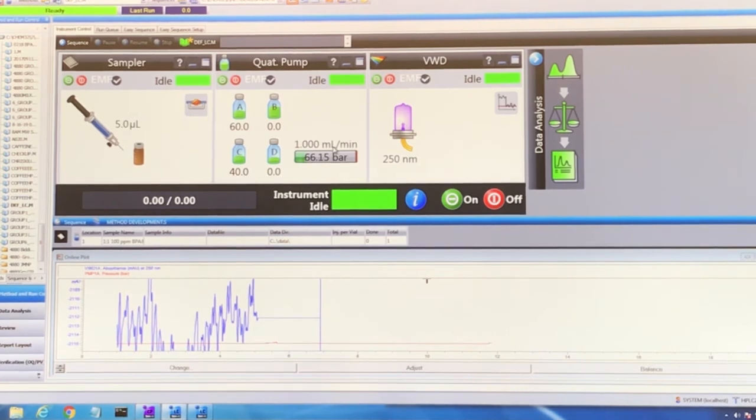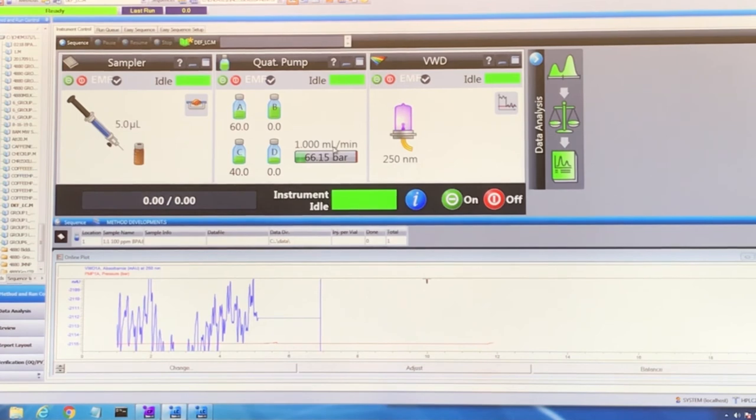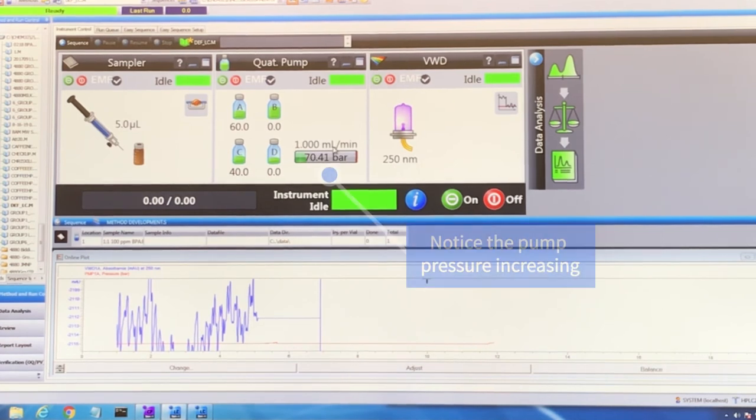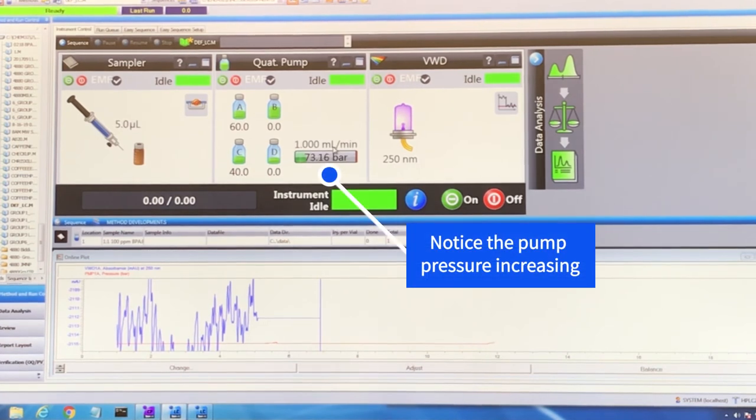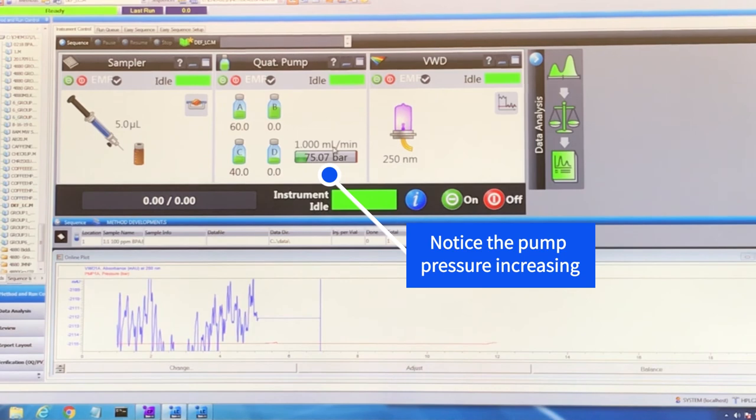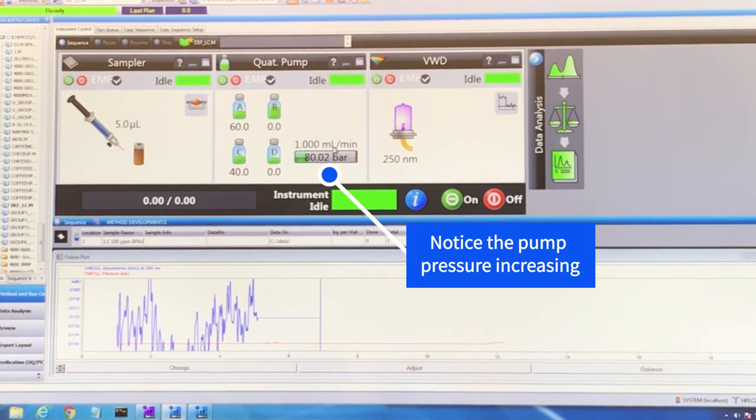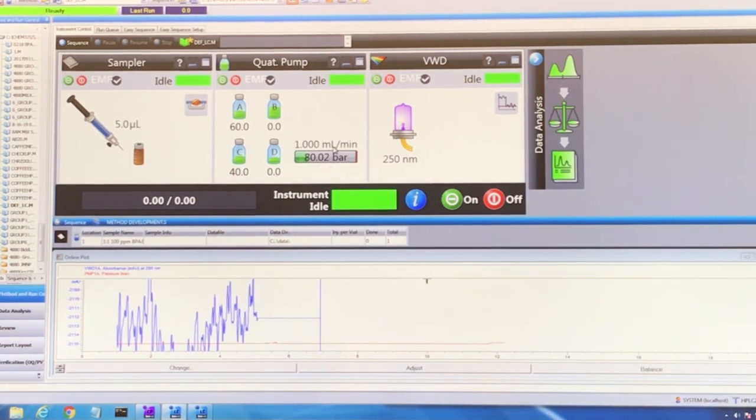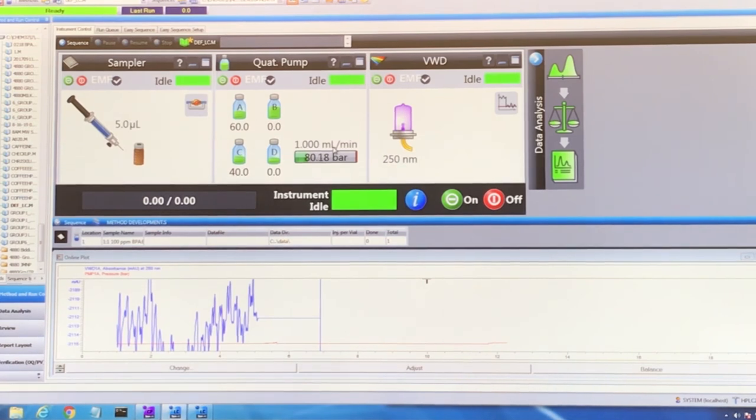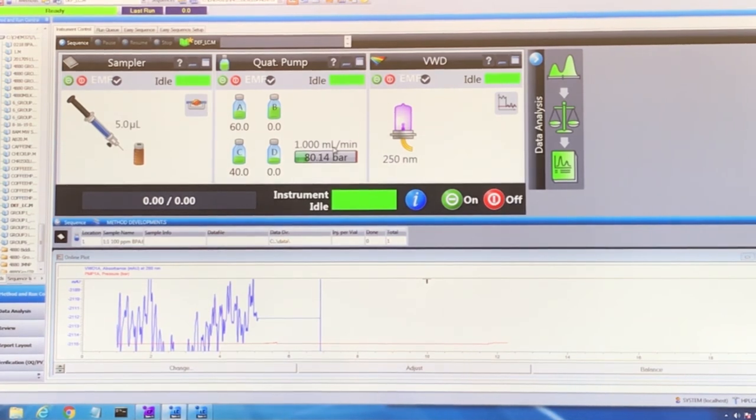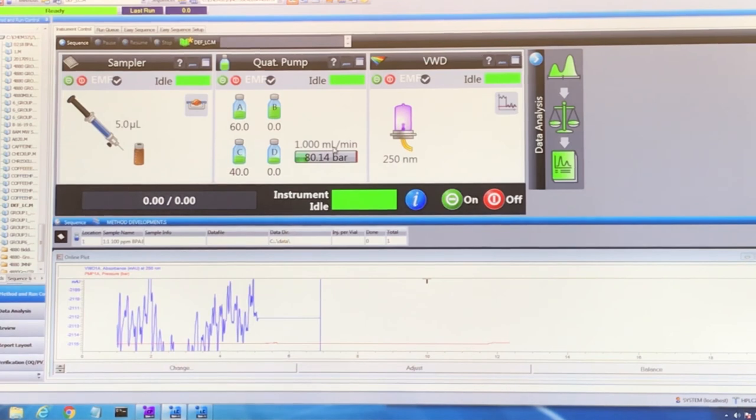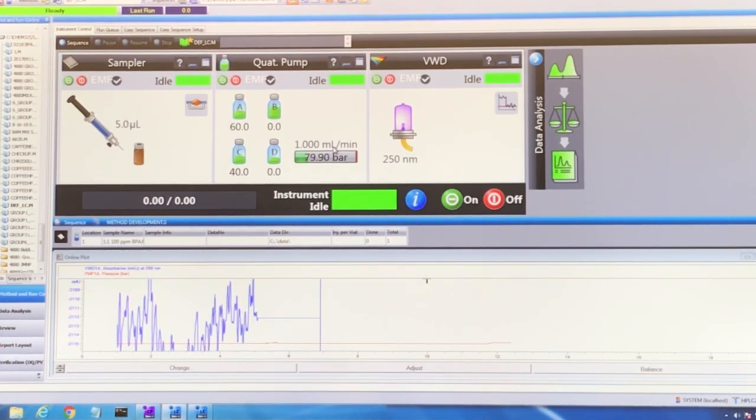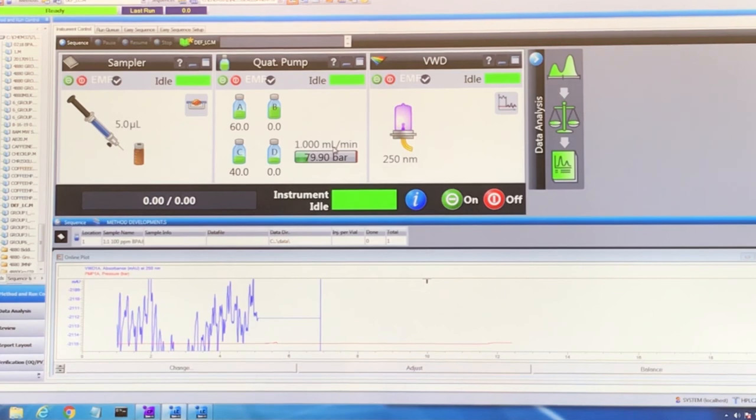Now, instead of the solvent going out the waste tubing, it's going down through the rest of the instrument into the column. We're going to let this flow rate stabilize and make sure that the pressure is stable. That probably will be another 5-10 minutes. It just depends on how long it's been since the instrument has run.